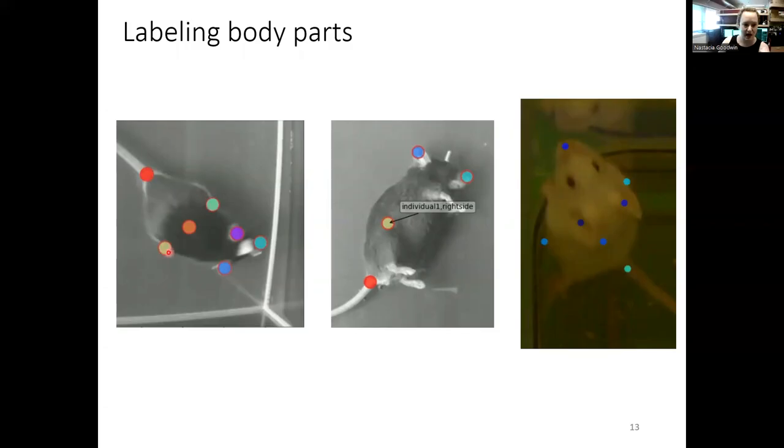It doesn't really matter how you're doing this, just be consistent. The right side is always the mouse's right. If you're having students do this for you, triple check that they know their left from their right. One time I had to spend 5 days going through and fixing sides on an animal. That was a really, really bad week.